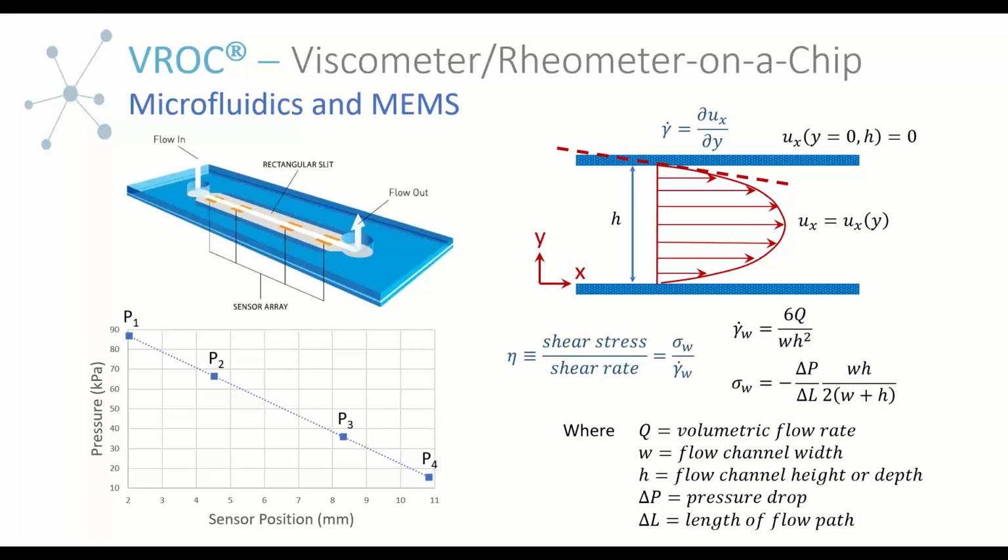And they're derived based, as we said, on specific assumptions. And I have a diagram here to help understand what some of these assumptions are. This is the visual of our flow field in our microfluidic channel, and these arrows represent the magnitude of velocity at a particular spatial point.